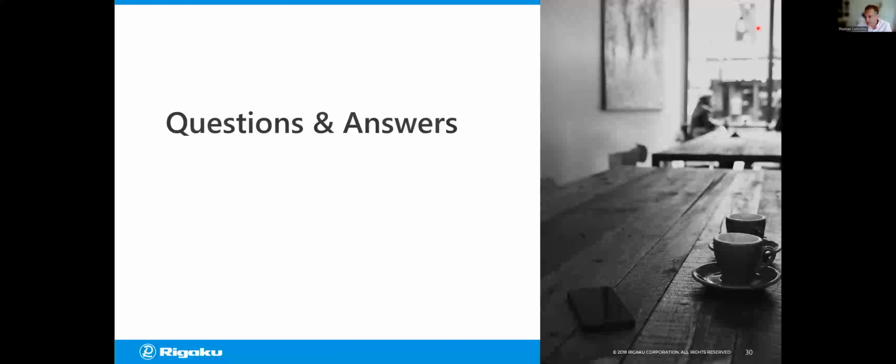It looks like our final question, and we are running up on time here, is from Mustafa, and he's asking: would the diffraction from crystals dispersed in the amorphous matrix versus crystals that grow within the amorphous matrix be different? So would that diffraction be different if it was grown within or outside of the matrix?